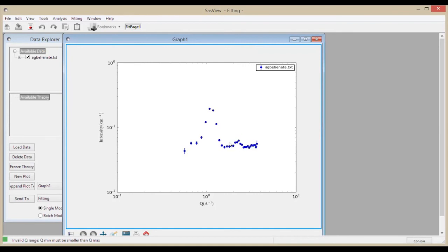So this is one of the test measurements that has been done sometime. What should we know about the sample? The sample is a powder, and it is crystalline. It contains crystalline peaks. So these peaks are in fact real, normal diffraction peaks. This is the first order, this is the second order. But the layer distance between the atomic planes is so big that it falls into the range of small angle scattering. And we use this powder for calibration because we know exactly the spacing.